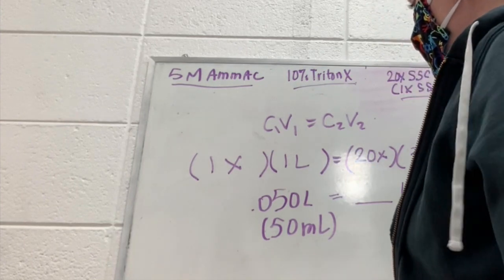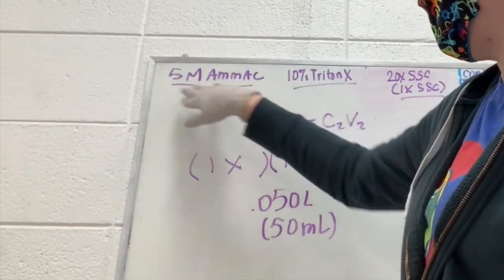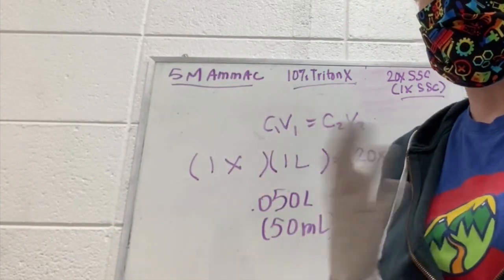And you can also use this if you are not generating a molar solution from a powder, but if you're diluting it.